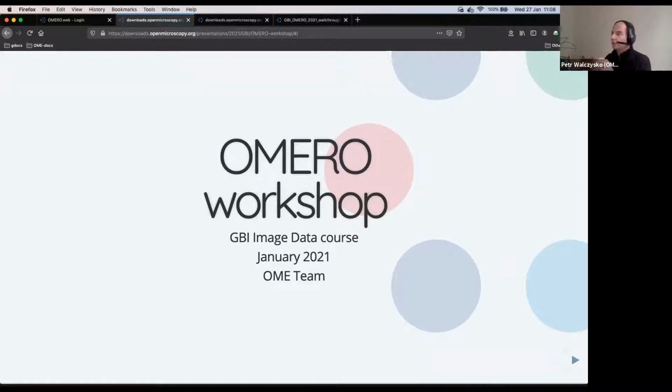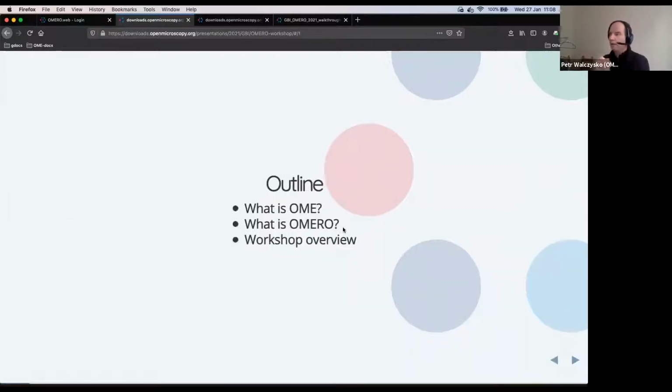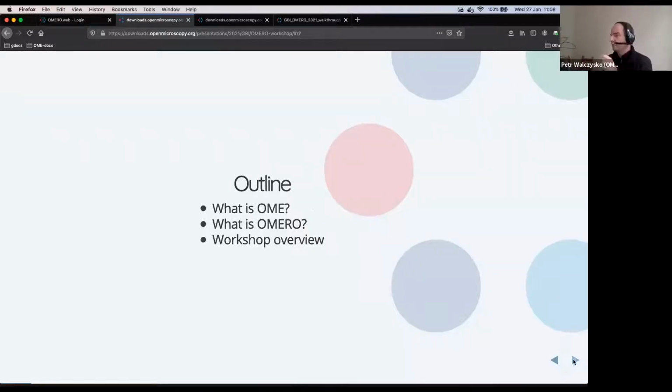So today in the presentation we would like to tell you what is OME, the Open Microscopy Environment, what is Omero, and then give you some workshop overview.